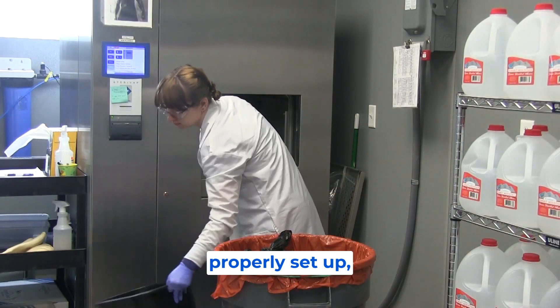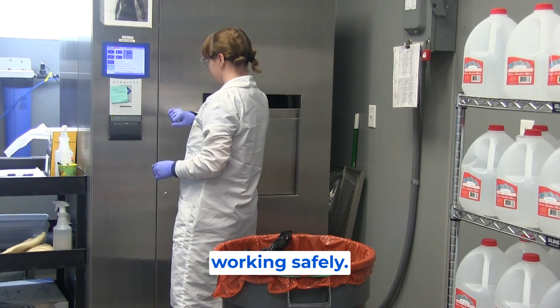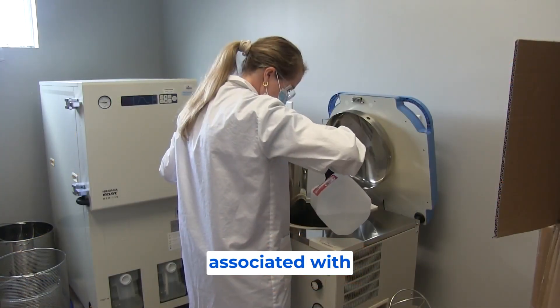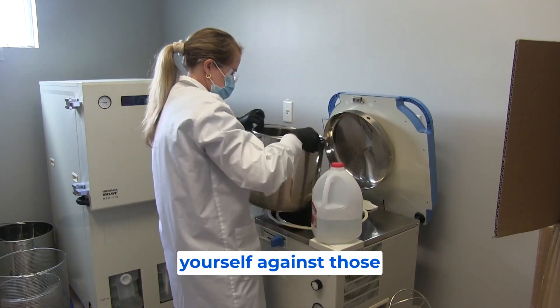The awareness of how to properly set up, manage, and maintain an autoclave is critical to working safely. What are the dangers associated with operating an autoclave? How can you protect yourself against those risks?